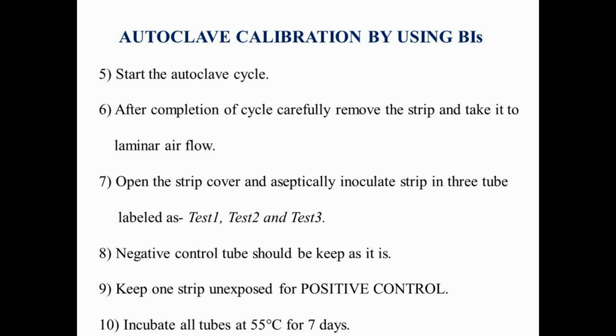8. The negative control tube should be kept as it is. 9. Keep 1 strip unexposed for positive control. 10. Incubate all tubes at 55 degrees Celsius for 7 days.